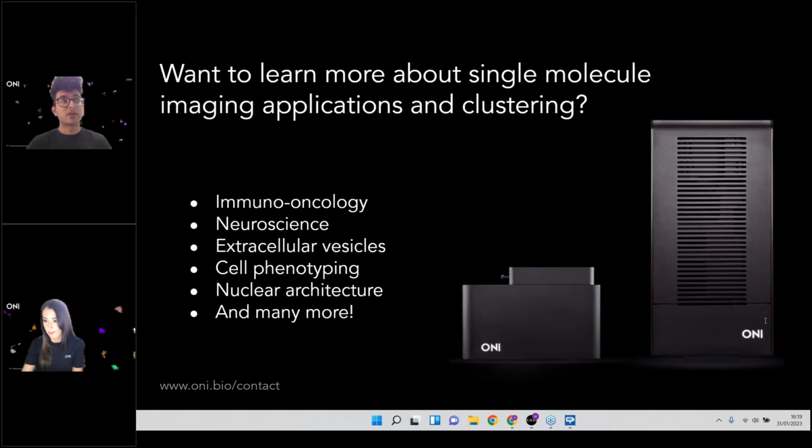Yeah, so this is a great question. One thing that we're building with the collaborative discovery platform that I introduced briefly today is a space for any kind of analysis algorithm. That means that we'll be adding more and more methods to this platform. We already have DBSCAN, HDBSCAN, and this constraints method that we've developed. But we would love to add other methods like Voronoi clustering or k-means or anything else that you're interested in using.